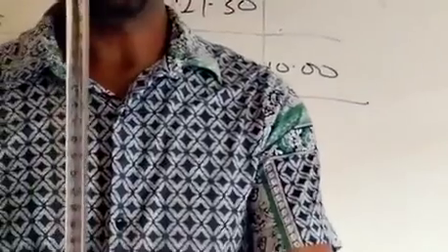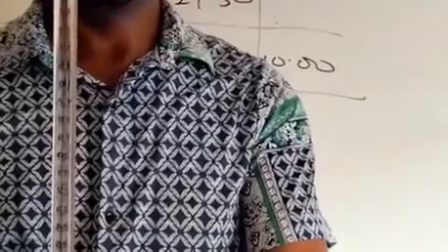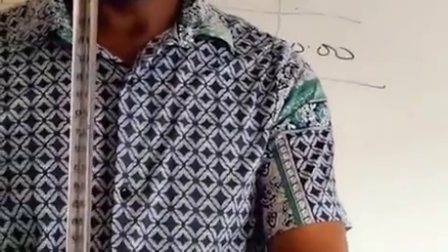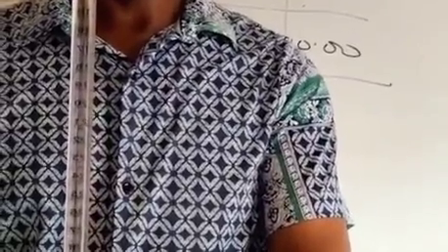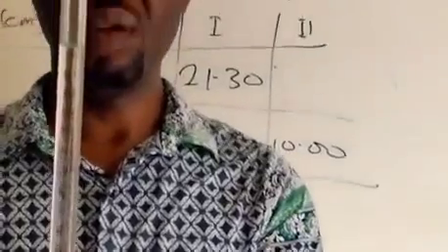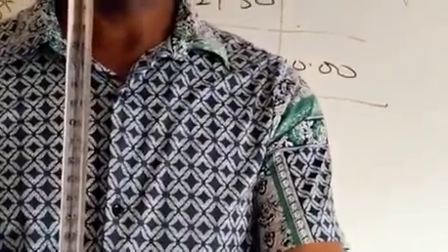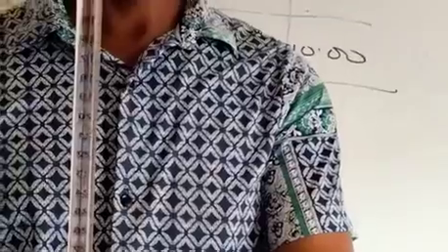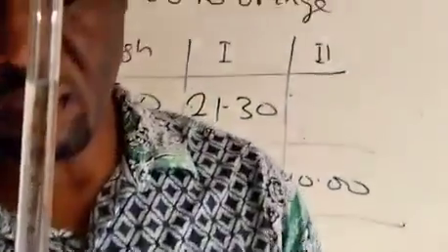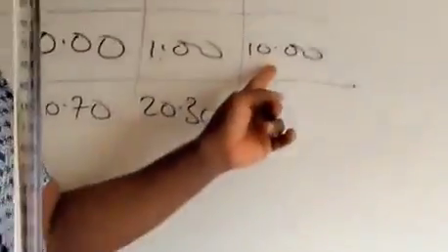So let me move it faster. It's going down, as you can see. We're moving to 10. Once it's 10, I'll close the tap. So we have 10 as the initial reading, the tap closed, and that is what we recorded here.